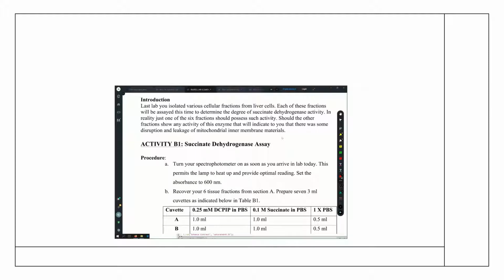Okay, so I found this in the nuclear. Succinate dehydrogenase was not supposed to be in the nuclear. I had contamination, and then tell me what could have happened. Like maybe when you were breaking the liver cells apart, maybe you were too rough and things broke and the mitochondria ended up in all the fractions. Like that could have happened. Like tell me what else went wrong.